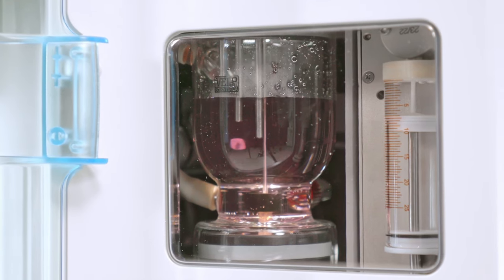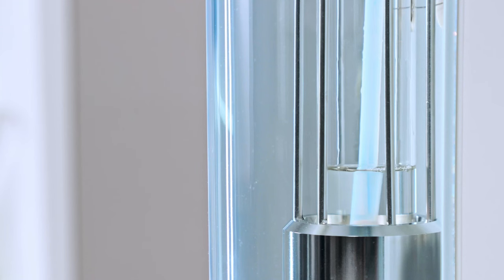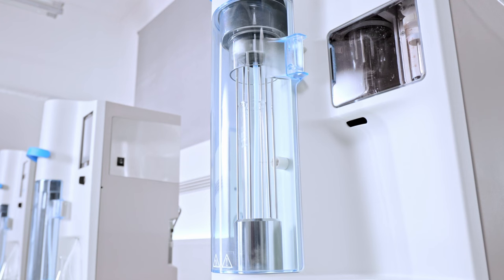At the end of the analysis, the UDK169 automatically cleans the titration vessel and tube, draining them from residues and driving them to the dedicated tank.